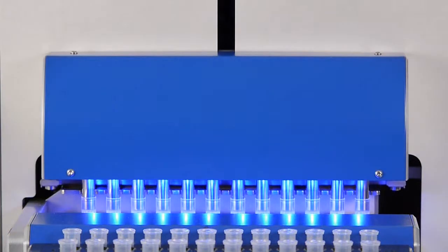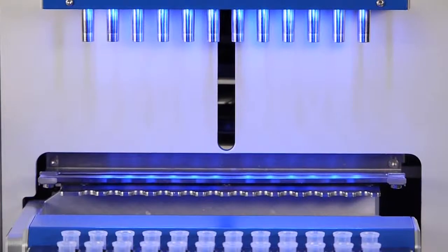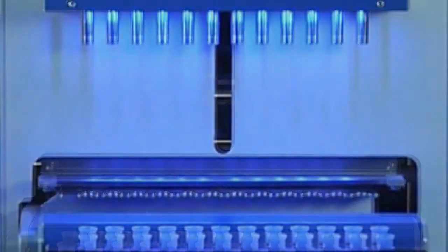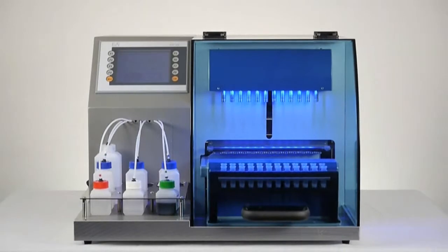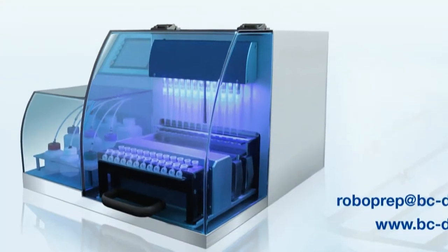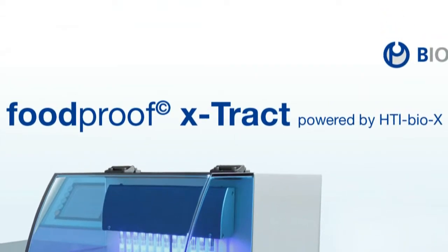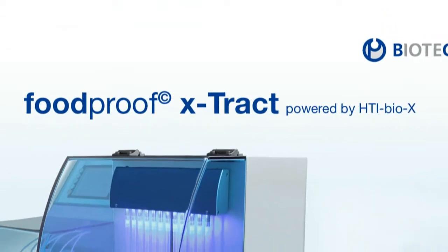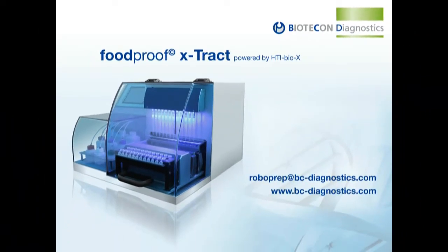During the entire automated purification process, just one filter tip, one reaction tube, and one elution tube per sample is needed. The automated DNA extraction is completed in just 50 minutes for up to 12 samples in parallel. For more information on the Foodproof RoboPrep Extract and other products, please contact Biotecon Diagnostics. We look forward to answering your questions and working with you to fulfill your pathogen detection needs.